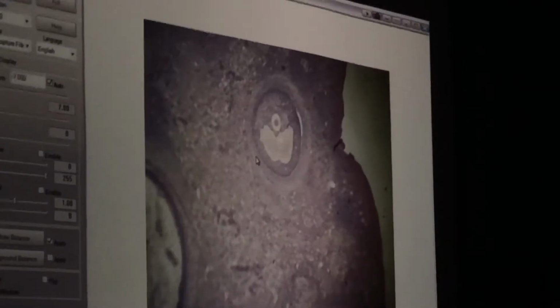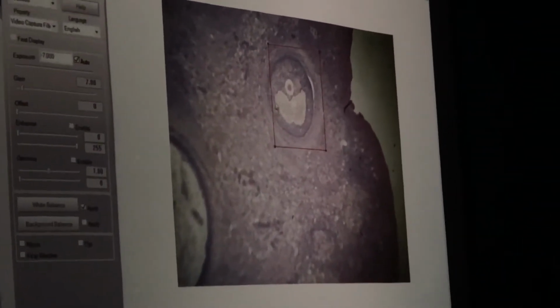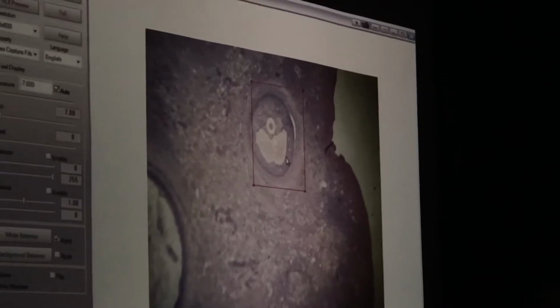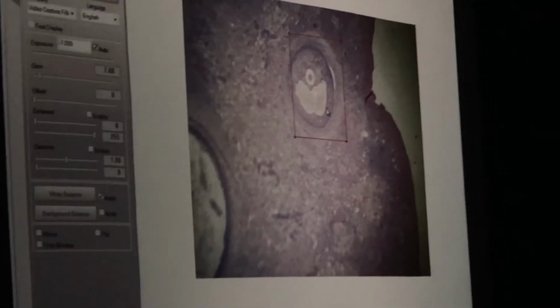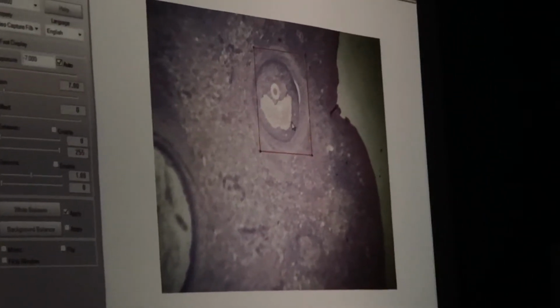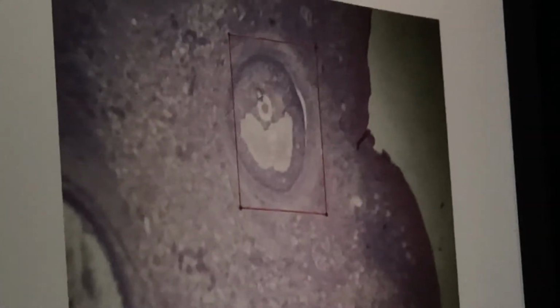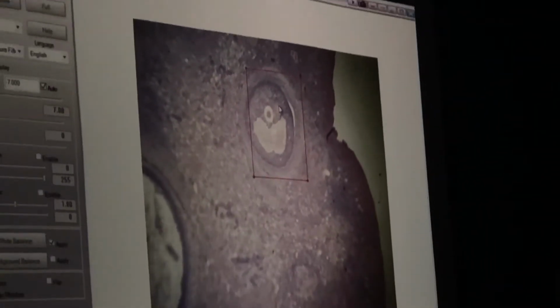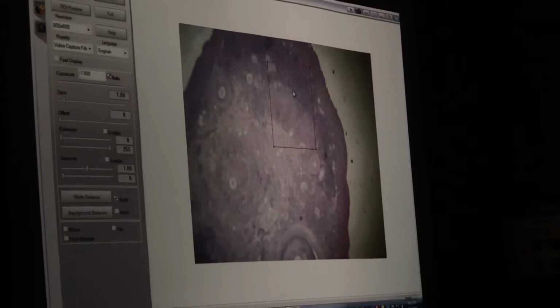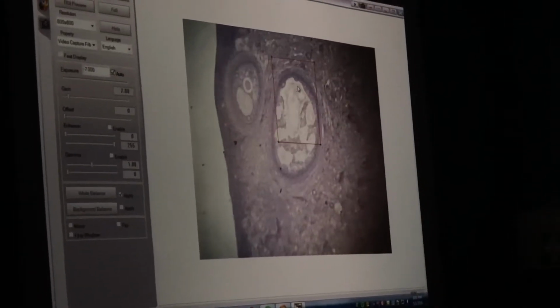Likewise, if I look at this guy right here, and I go, well, this is way smaller, it must not be a mature follicle, I could be wrong, and in this case I probably am, because I think what we're seeing in that box right there is, okay, here's my follicle, the egg's sitting at the top. I probably cut through right near the top. And I think that because I think that these cells that I'm seeing right here are actually part of the follicle wall. All right, so again, this is one of those exercises where you have to use your spatial visualization skills to try to figure out what's what.